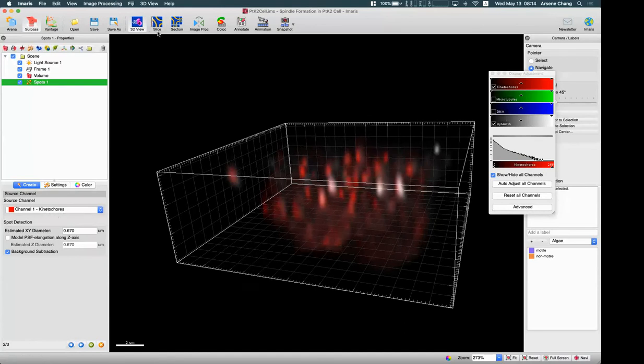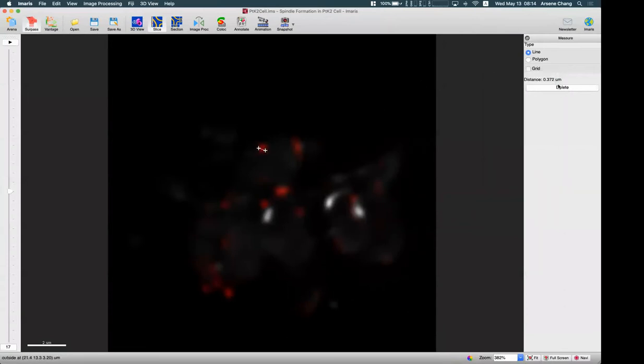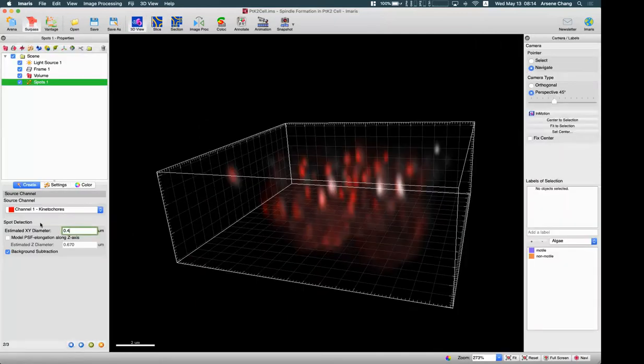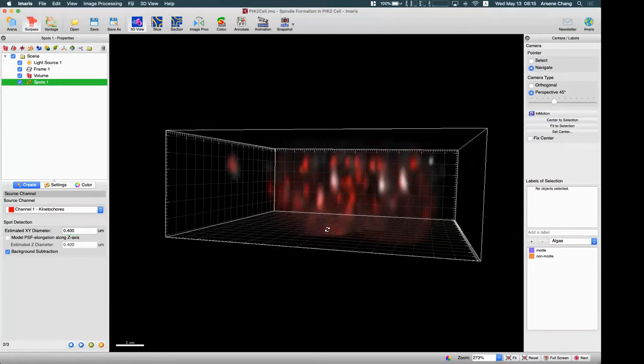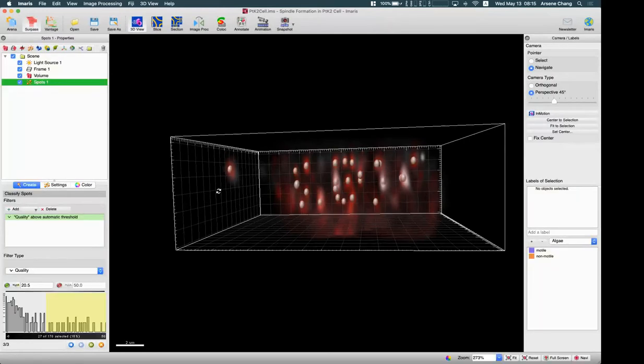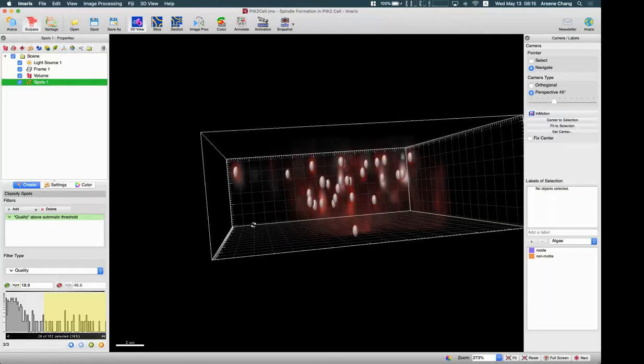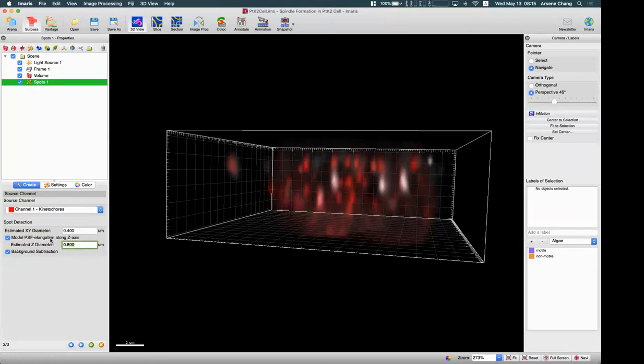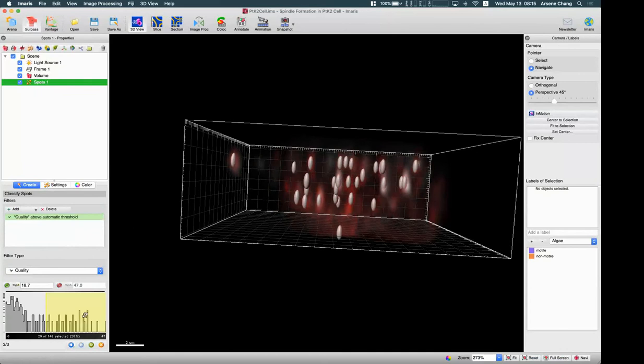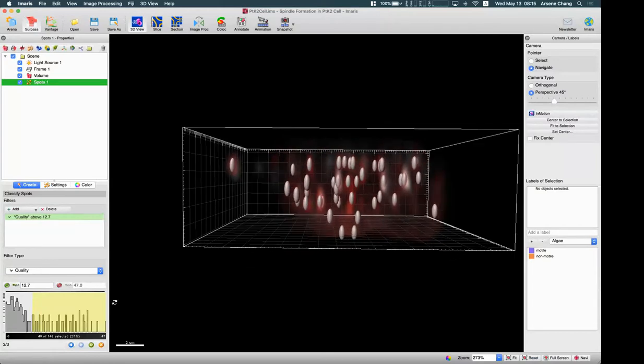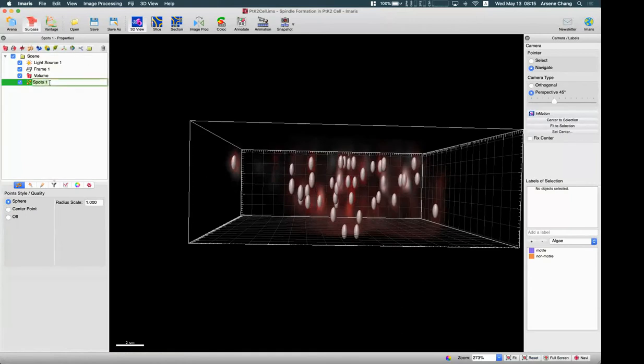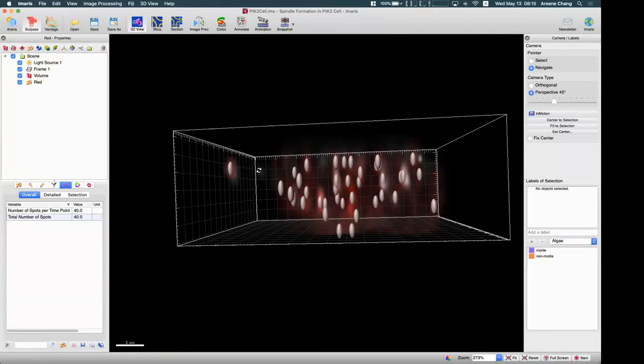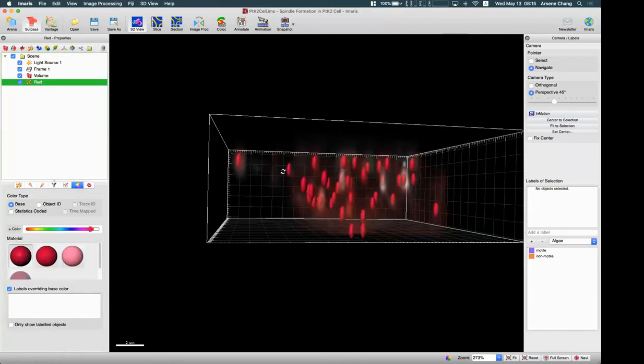This automatic spot creation we already went through in last week, so I will just go through quickly. Channel one, and we need the size. Here I'm going to measure the size of this red color, it's about 0.3, so I will use 0.4. I can see a bit of the z elongation, so I will try to use these numbers. Maybe double the x, y size. So maybe even larger. Looks good. We can adjust the threshold to make more detection like this. Then we can rename this to red. Then we already can see the total numbers here for the red staining.